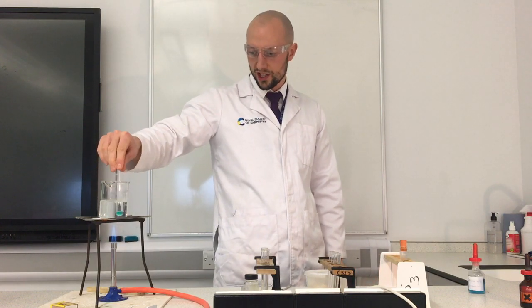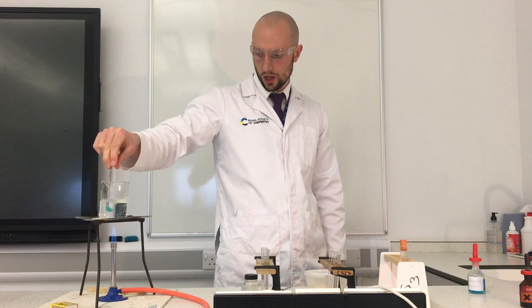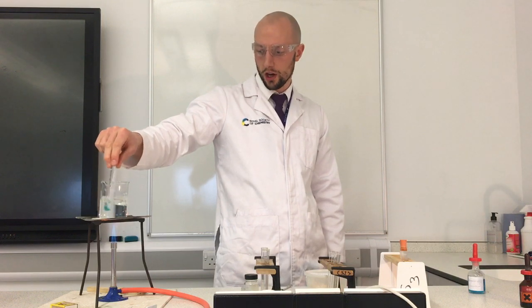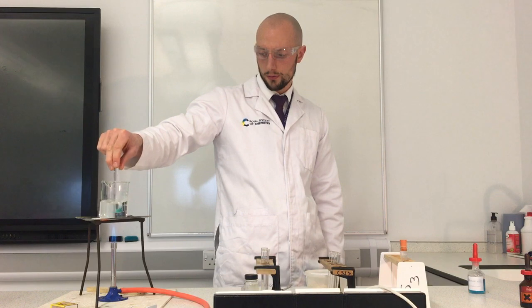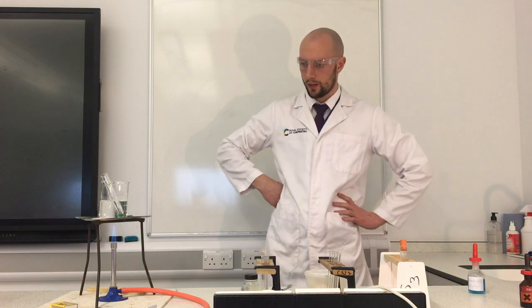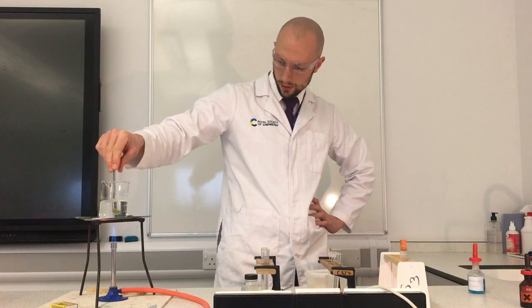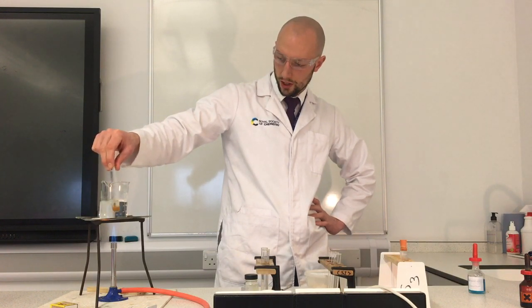So I'm going to put it in there, stir it around, give it a little bit of time, see if it changes colour. Remember, if it's got glucose in it, it will turn from blue to red. Oh, I think it's starting to change colour now. It was blue. It's looking a bit green. Now it's looking maybe a bit orange.